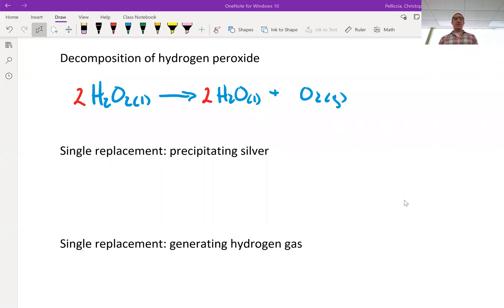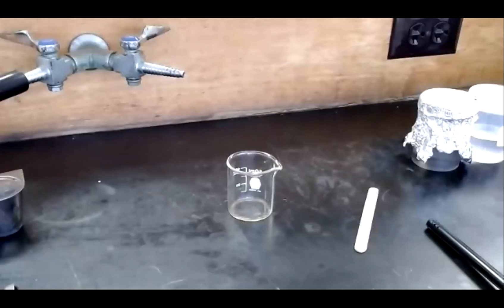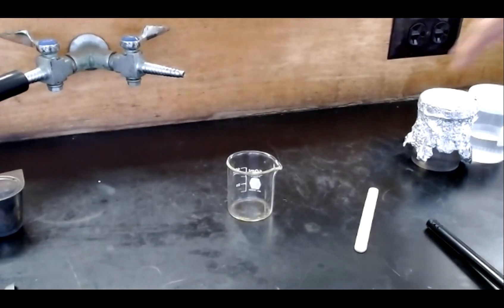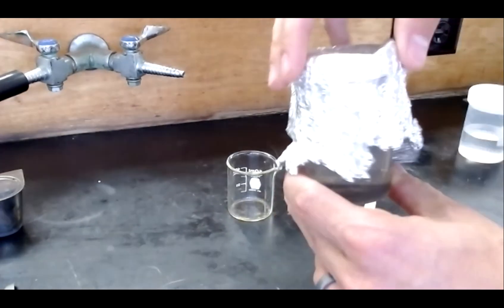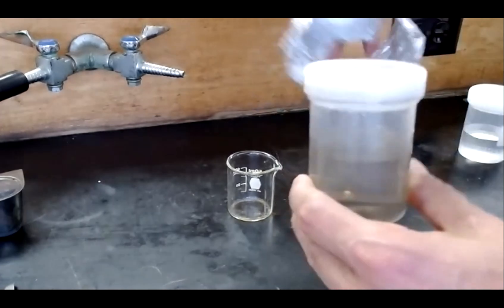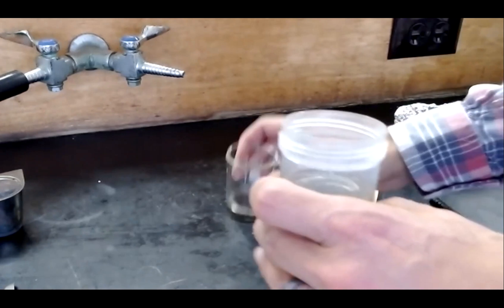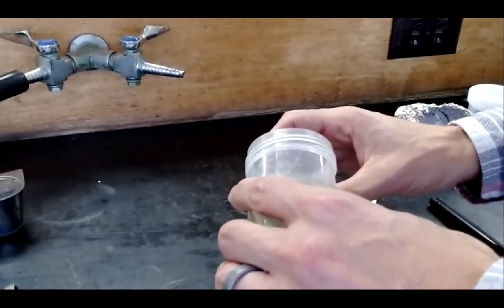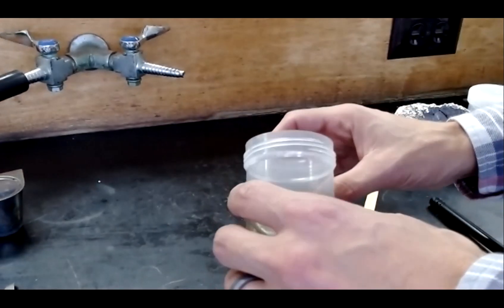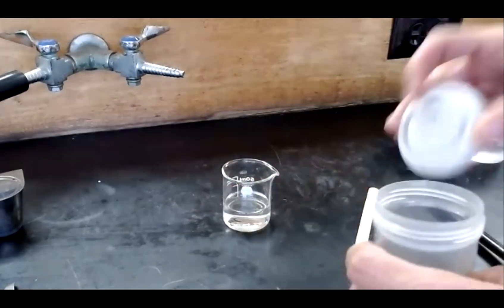The third kind of reaction I'd like to show you is a single replacement reaction in which we will precipitate some silver metal. The setup here will be a piece of copper wire being inserted into a solution of silver nitrate. I'm going to add a solution of silver nitrate to the beaker here. Silver nitrate is oftentimes kept underneath aluminum foil because it's light sensitive. You might remember me saying earlier that silver nitrate used to coat film paper and when exposed to light would be developed and generate early style photography.